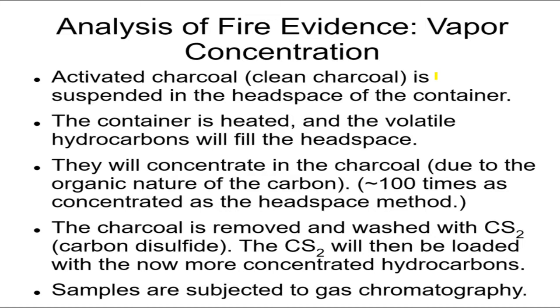But anyway, it's very porous, and stuff in the air will get stuck in the pores of the activated charcoal, and the poisonous part of the air will simply not get to the person who's breathing it. Anyway, they were actually used for gas masks at first. But anyway, we use activated charcoal. It absorbs a lot of stuff in the air, hydrocarbons in the air.